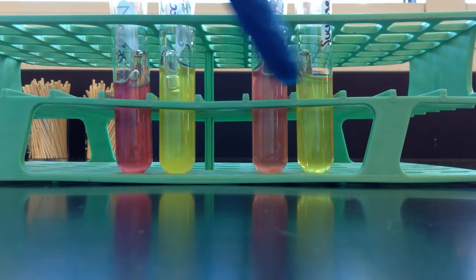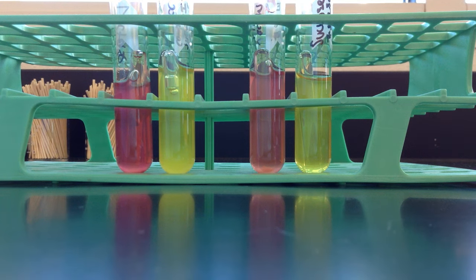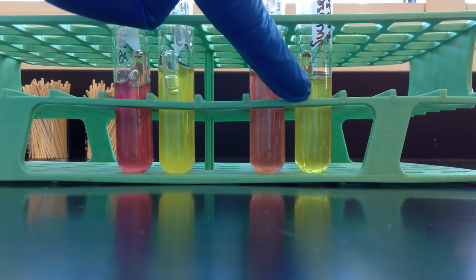On the right here, you've got the sucrose tubes, the same idea. Again, if an acid is produced, you get a yellow color.